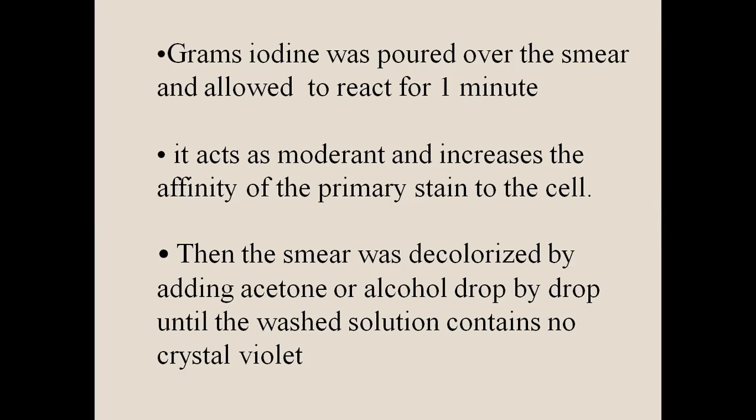Then the smear is decolorized. You add a few drops of acetone or alcohol drop by drop, until the washing solution contains no crystal violet. It will wash away the excess crystal violet, so the washing solution will be violet in color. You have to wash the slide until no blue color is in the solution, so that the excess stain is removed from the slide.